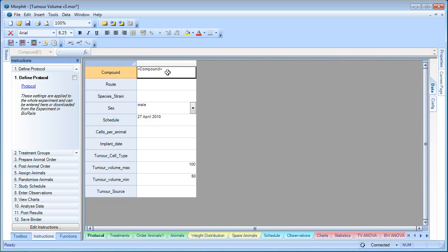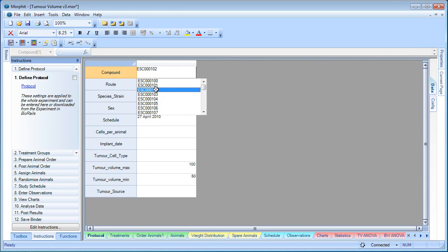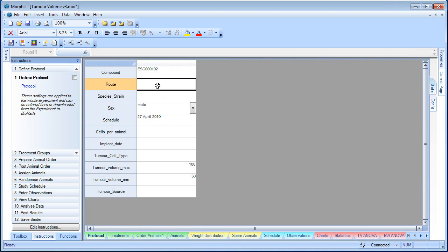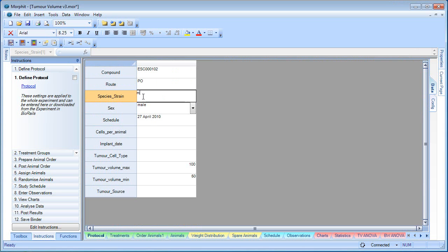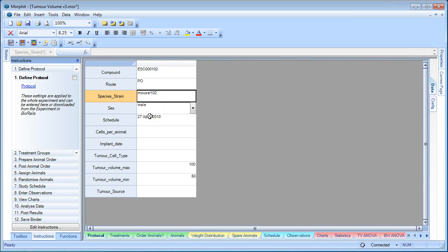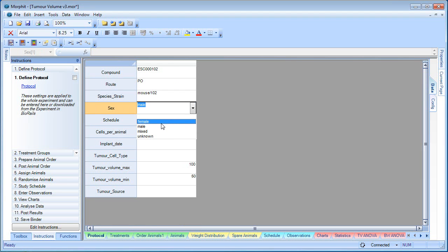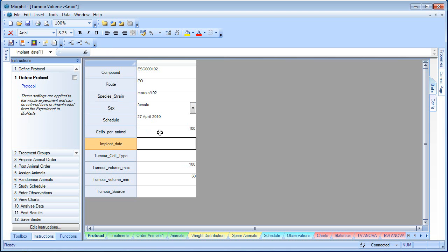Let's set up the protocol. I've selected a compound, the route of administration, the species and strain, and sex. All these dictionaries are populated from BioRails, which we've already connected to.